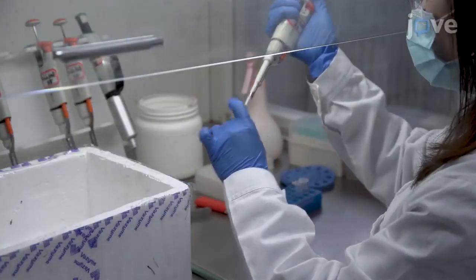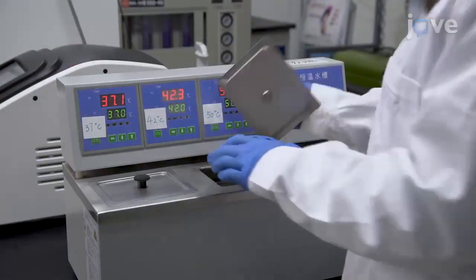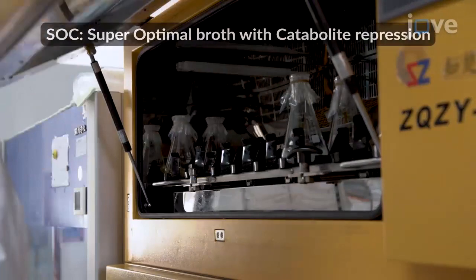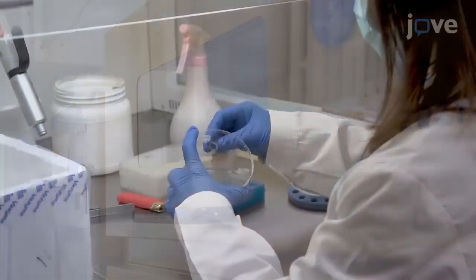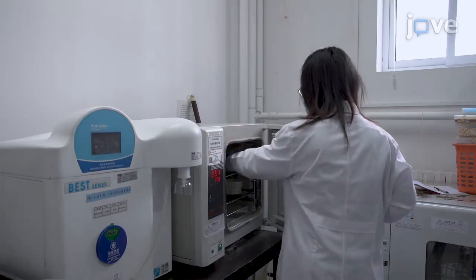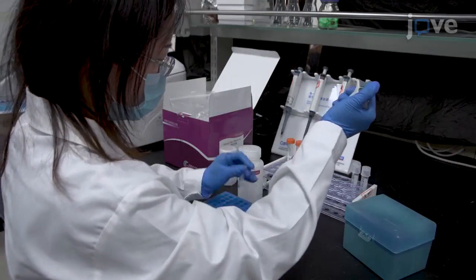Transform 5 microliters of the assembly product into 50 microliters of competent cells at 42 degrees Celsius for 30 seconds. Recover the cells in super-optimal broth with catabolite repression medium at 37 degrees Celsius for 1 hour. Then, plate them on LB agar medium and incubate overnight at 37 degrees Celsius. The next day, use a preferred commercial kit to isolate the plasmid.